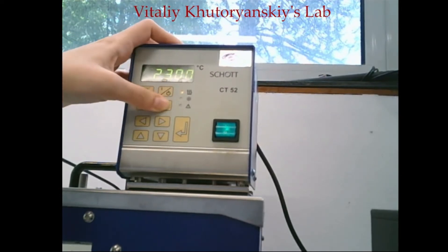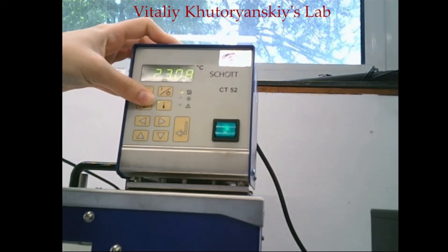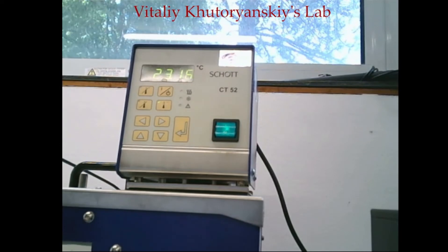When you have set your temperature, press enter, then start it. Now we are waiting for the temperature to reach 25 degrees.